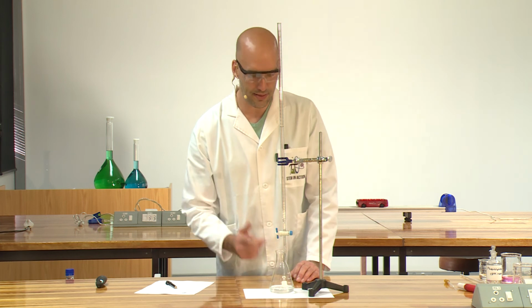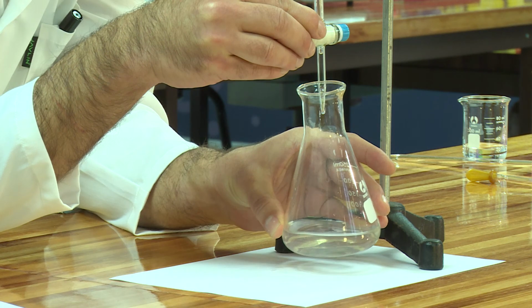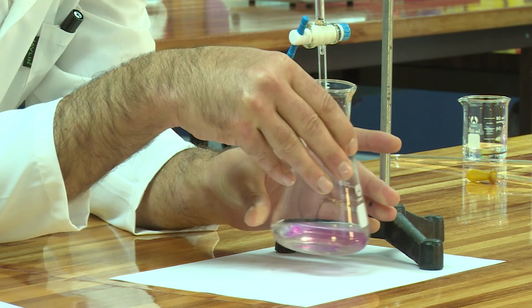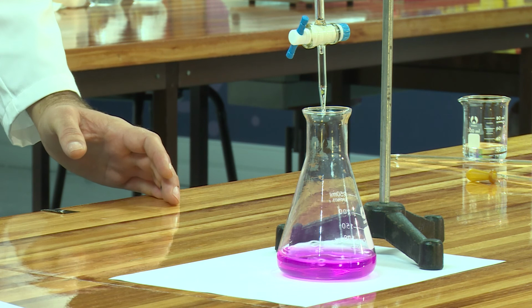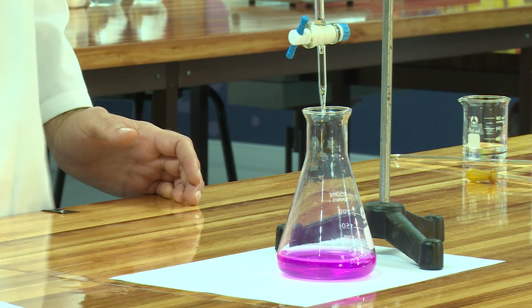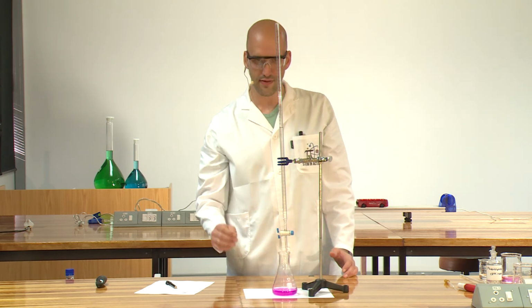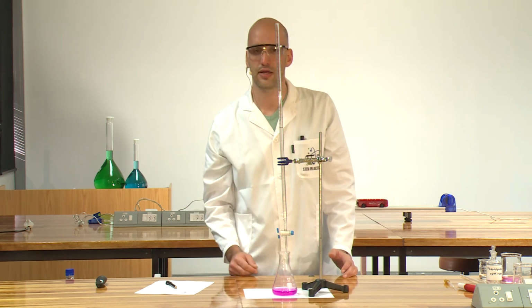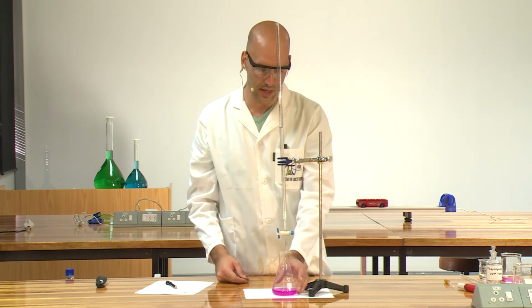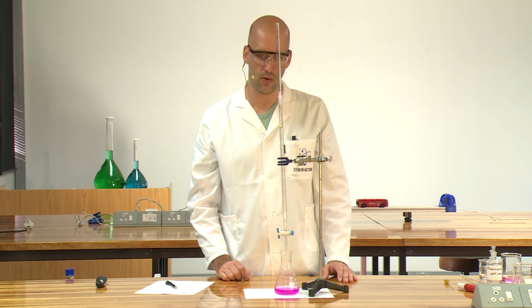Okay, but let me show you the pink color. When we go a little bit more and add a couple more drops in there and shake it, we'll see that the color is changing. That will show me that I've over-titrated, and that's not the color that I'm looking for. I was looking for that faint pink color that lingers a little bit and then disappears. Then we know that is our end point. As you can see, this color is going to stay there for a while.